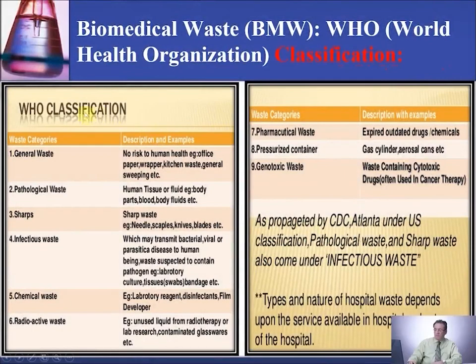So, as we know, WHO classified the waste in healthcare facilities into 9 categories. In the laboratories, you're going to end up from these categories. Basically, in most labs, you're going to have either chemical waste or the rest of this waste, or general waste, which can be trash normally. No big deal there, but we are concerned about the infectious waste, or the biohazard waste. So you're going to end up either with the chemical waste, which we talked about in the lesson on how to handle chemical waste.